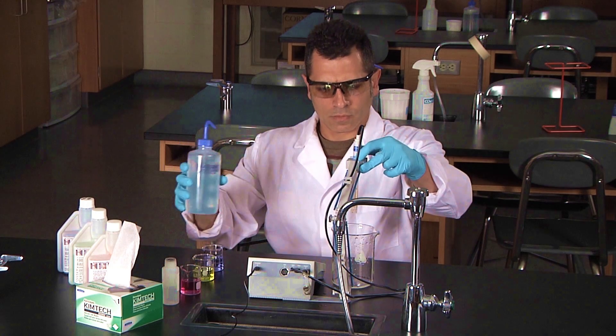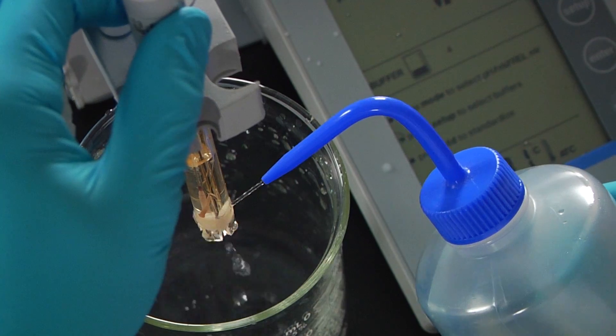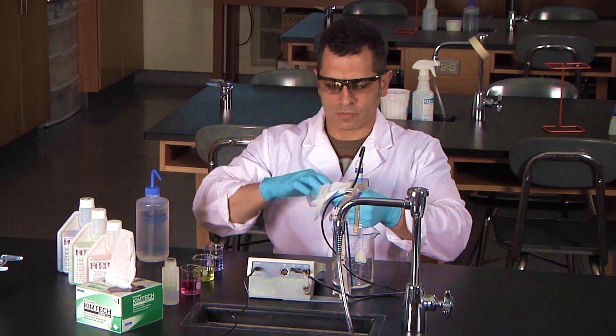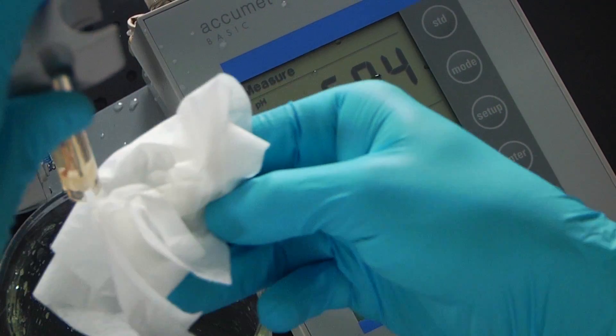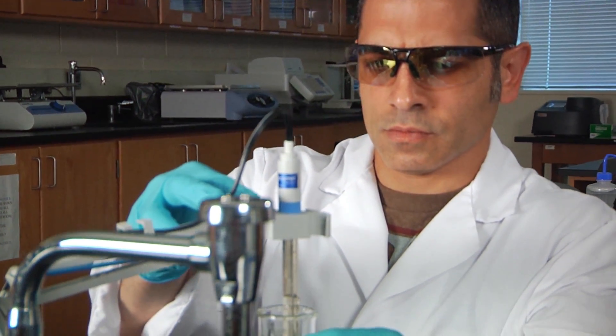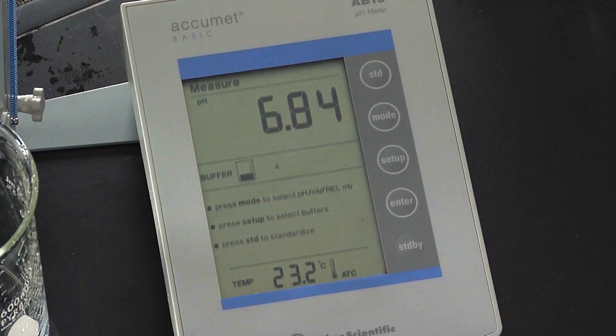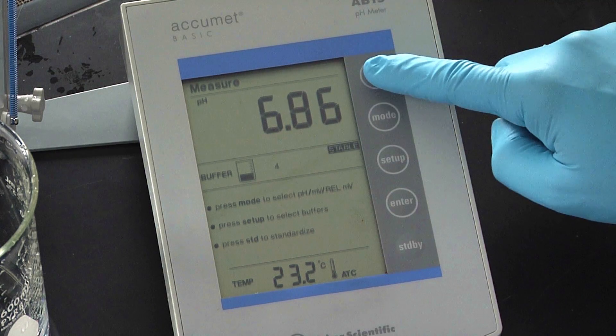Remove the probe and rinse it with the deionized water. Carefully blot the bottom of the glass bulb. Now place the probe into the 7.0 standard buffer solution. Press the standardized key.